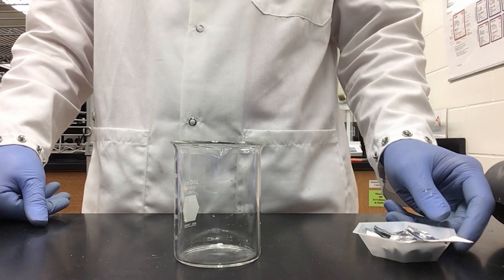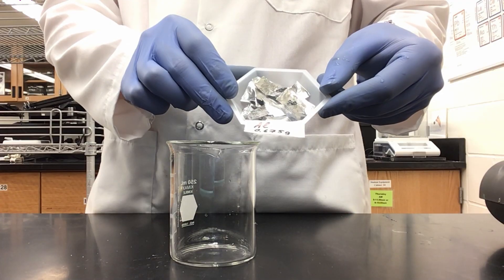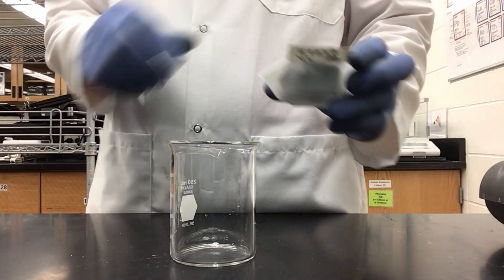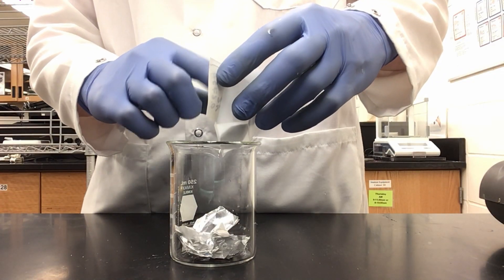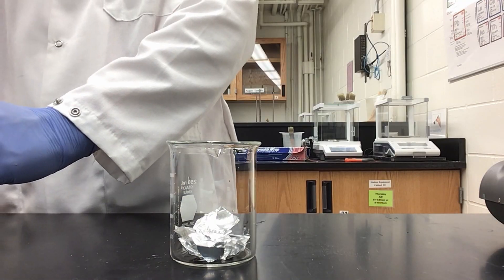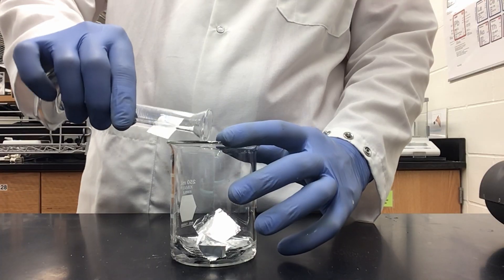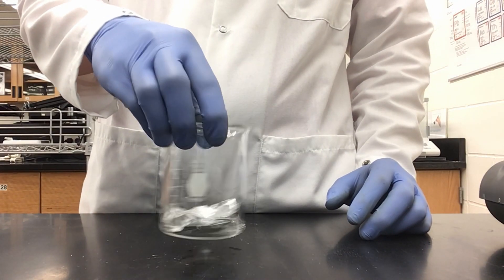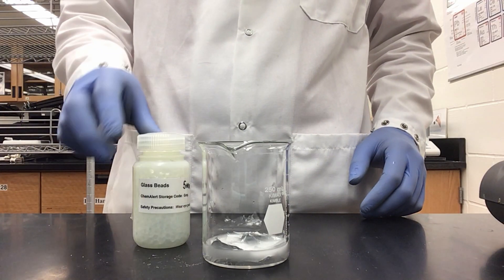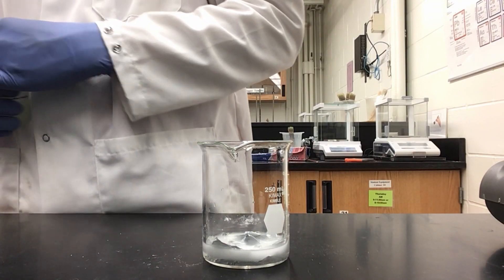Now we can move on to Part 1B, preparation of potassium aluminum sulfate. I have my 250 ml beaker freshly washed. I have measured 0.675 grams of aluminum because I have chosen to make 0.025 moles of my potassium aluminum sulfate. I am going to add in my aluminum. Then I need to add in my potassium hydroxide and water — also based on the moles of aluminum. I will also need to add 10 glass beads since we are heating again.